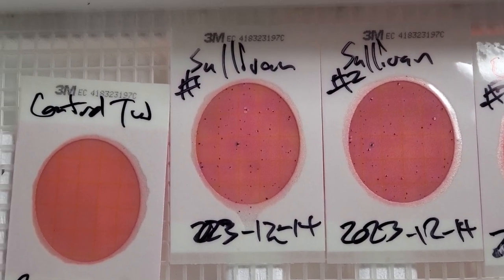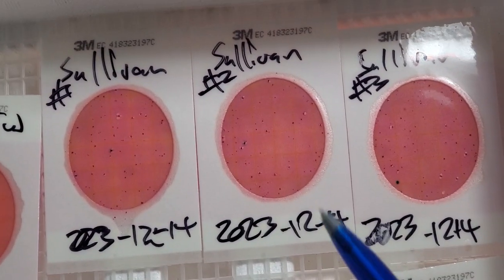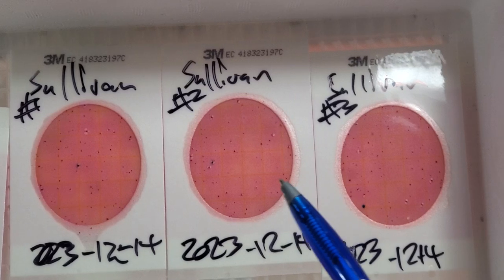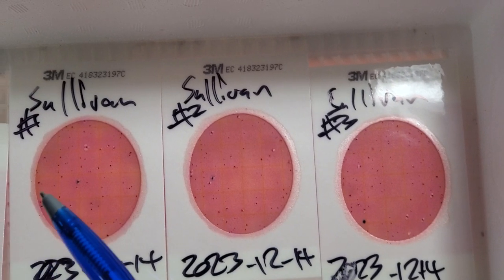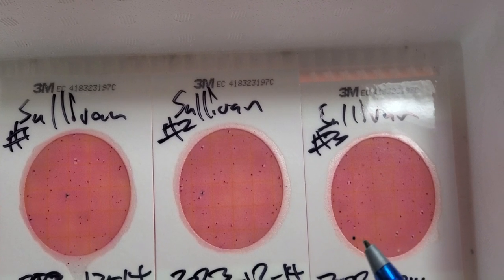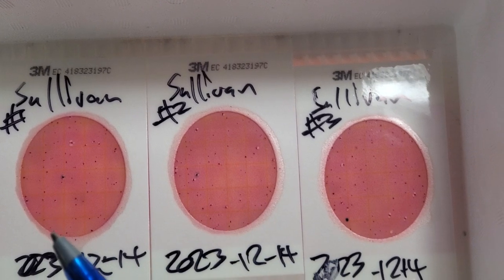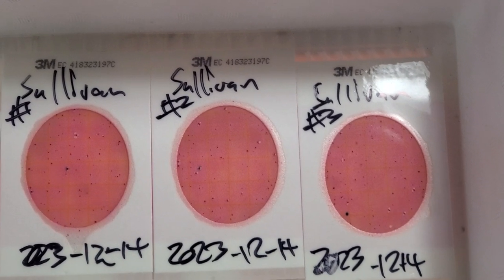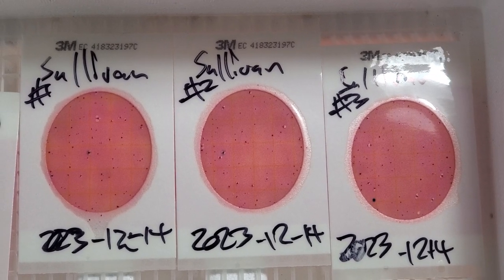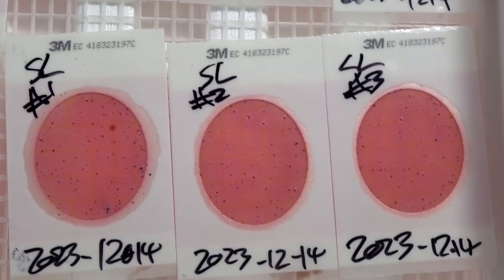Sullivan Launch: we got one colony there, one colony there — I believe that would be one and one. There's also a blue one but it has no bubbles, so it doesn't count. So two, one, and zero — that's three times 100 divided by three, which is 100 colony forming units per 100 milliliters of water, because that's how much we put on here.